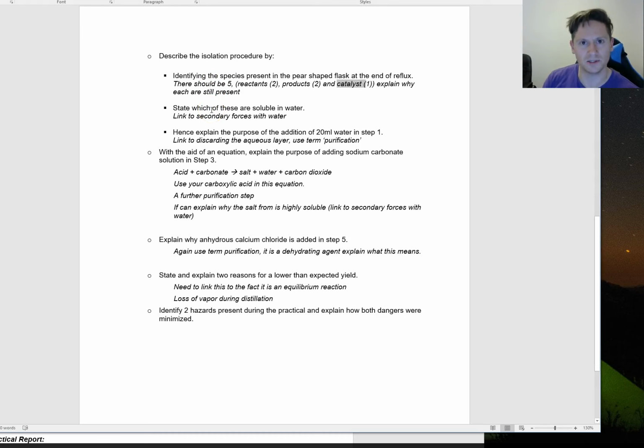And what we're trying to do is make sure the forwards reaction is favored, okay? And we can do that by siphoning off one of the products. One of the products of the reaction is water. You get the ester and water. If you siphon away the water, get rid of it, that reduces the reverse hydrolysis reaction happening, going back to the carboxylic acid and the alcohol. So we're doing a few tricks to try and prevent that as much as possible.